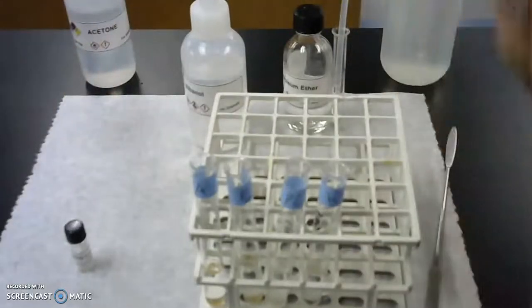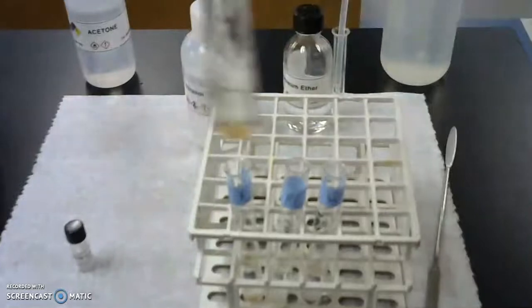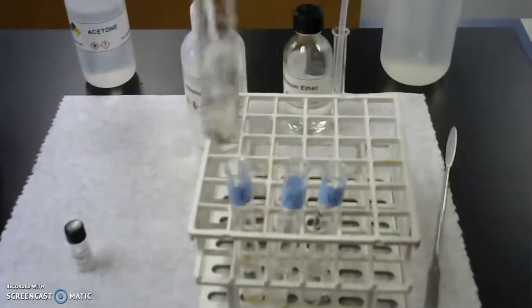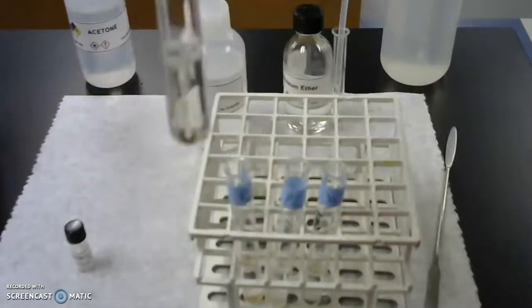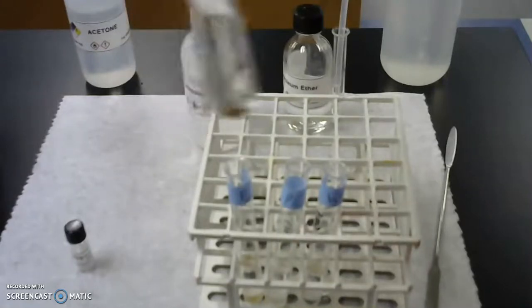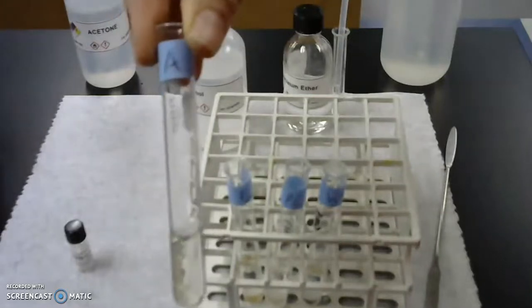So we're going to mix all of these up and look at what happens to them, and I want you to record your observations here. So this is the acetone. There's a little bit of the acetanilide in the bottom, and now I'm swirling it. And I want you to record what you see in terms of is there any left or is there none left in the acetone.